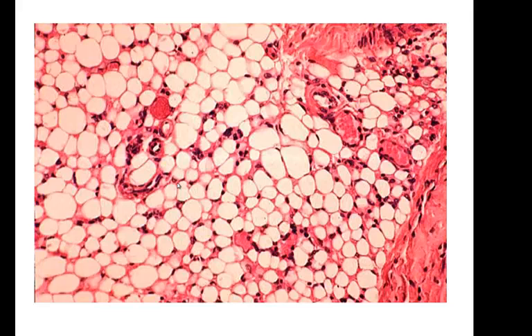And this might look like simple squamous epithelium to you, but this is just one whole cell right here, and its nucleus has been squashed out to the side. So if you want to compare this to the simple squamous epithelium of the lung, you can, and you can see how different they actually look. And so here's a fat cell. These are all individual fat cells, and all of this inside is full of triglycerides.